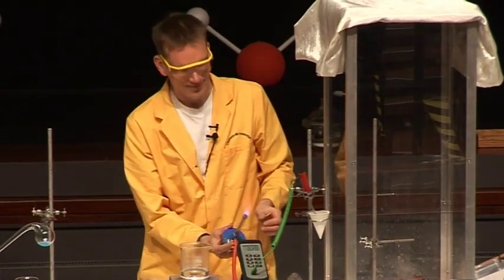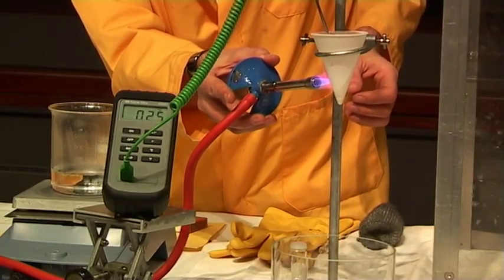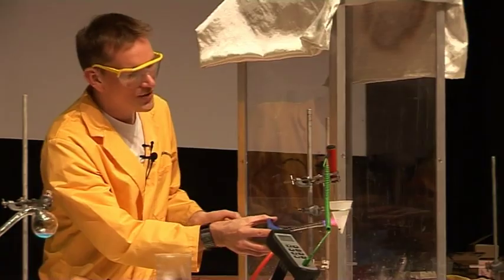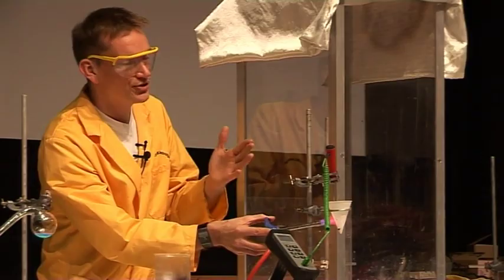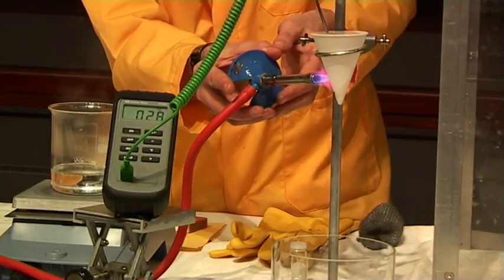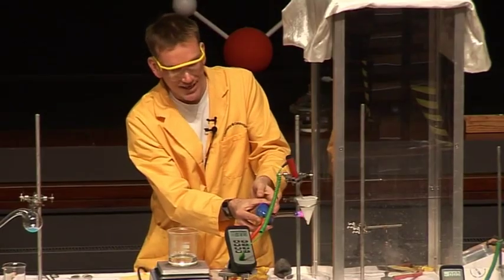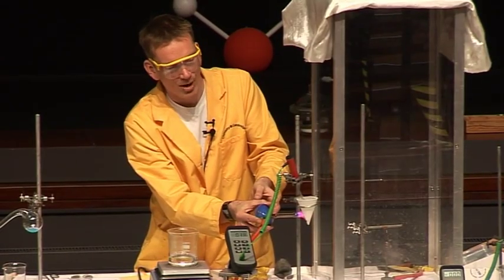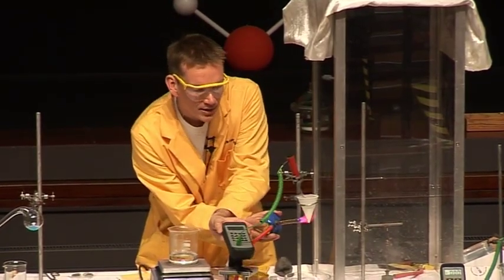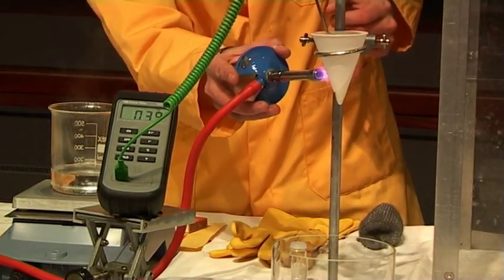Well, let's see. Okay. Now, interestingly, the paper cup is not burning. And this is because all of the energy from my Bunsen flame here is actually going into heating up the water. Now, the paper can't burn until it gets to a hot enough temperature, but the water is taking all the energy. So rather than heating the paper up at the moment, all the energy is going into heating up the water. So the water is now at 37 degrees C, 39. It's heating up. Well, we'll see what temperature this boils at.